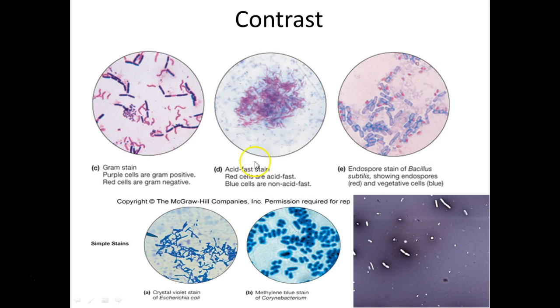These are more complex staining procedures where you're using multiple dyes. These staining procedures are referred to as simple stains because you're using just one dye, and again, typically just to be able to see the shape of the organisms and actually see them. Whenever you dye a bacteria, you're going to kill it, for the most part.